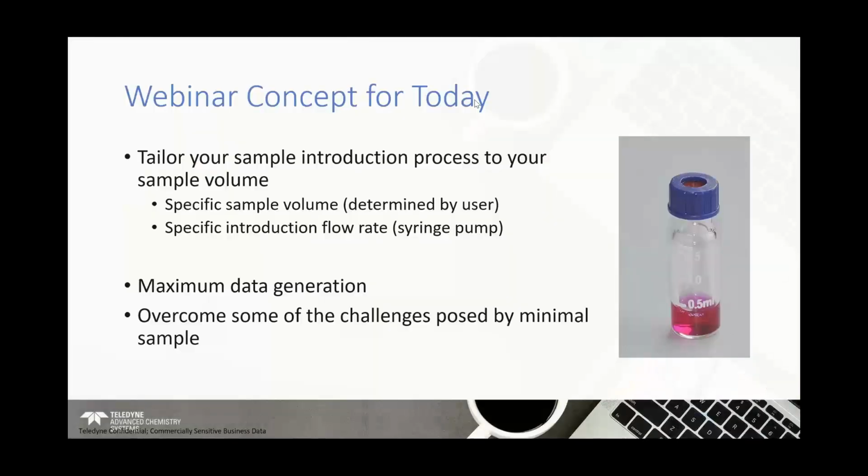Okay, at this point I wanted to return to the concept for today: the idea of tailoring the sample introduction process to the volume. I wanted to refer back to specific sample volumes and specific introduction flow rates. With that combination, and knowing what kind of data we want to generate, we can generate that maximum data.